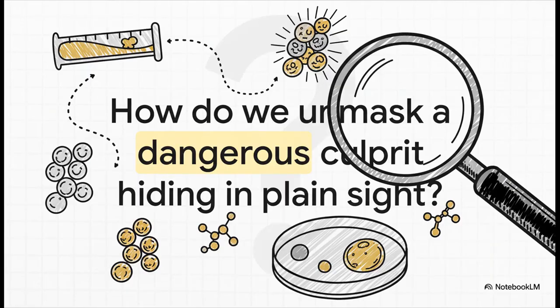So, just picture this for a second. You're in the lab, a culture comes back, and it's positive for Staphylococcus. Now you've got this critical question on your hands. Are we dealing with a harmless bug that just lives on the skin, or is this the really nasty one, S. aureus, a culprit that can cause everything from skin infections to life-threatening sepsis? Well, telling them apart, and telling them apart fast, is absolutely vital for patient care. And that, right there, is where the Coagulase test comes into play.